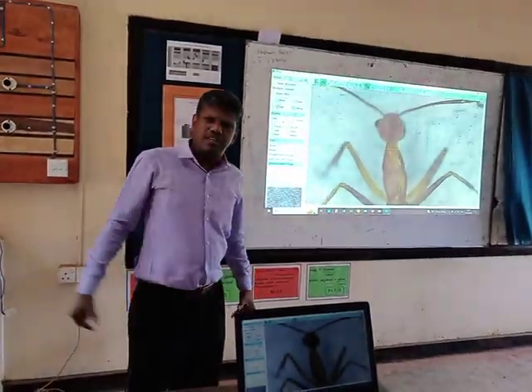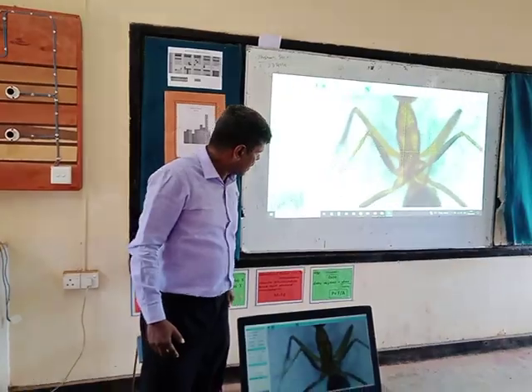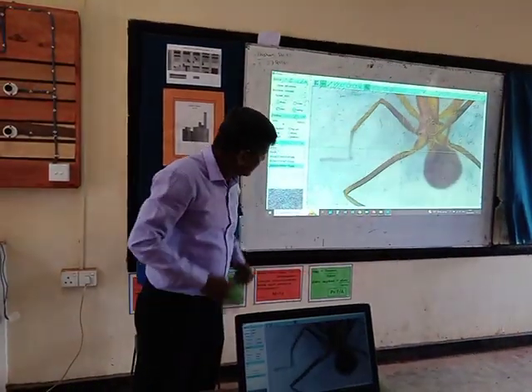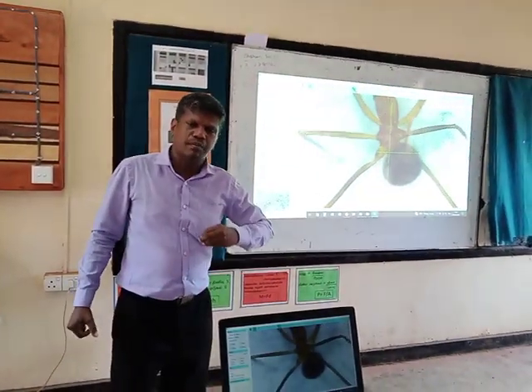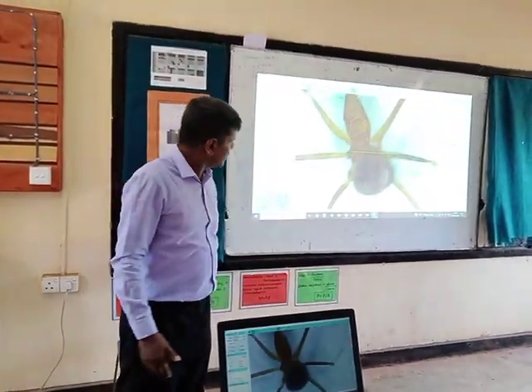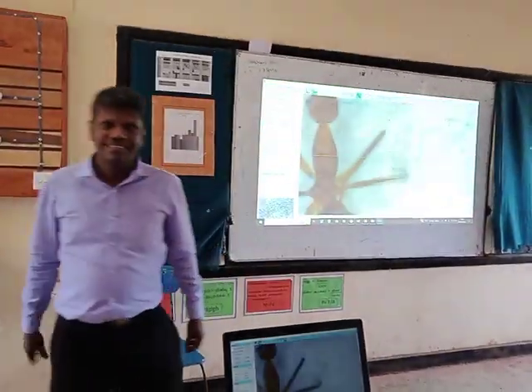So let's move on to another sophisticated device and make more advantage of it. Yeah, wait, hold on to another drawer.